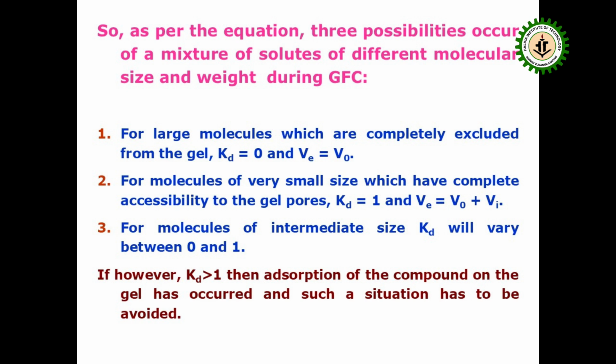So for molecules of intermediate size, Kd will vary between 0 and 1. If, however, Kd is greater than 1, then adsorption of the compound, that means non-specific adsorption of the compound on the gel, has occurred, and such a situation should be avoided.